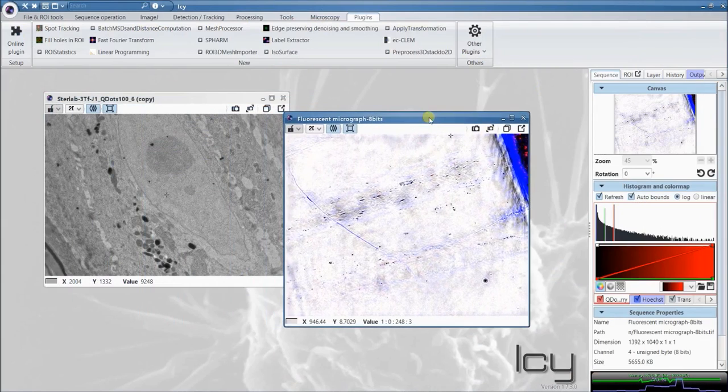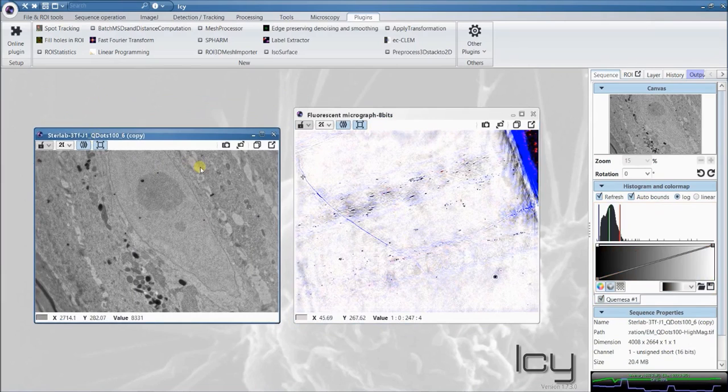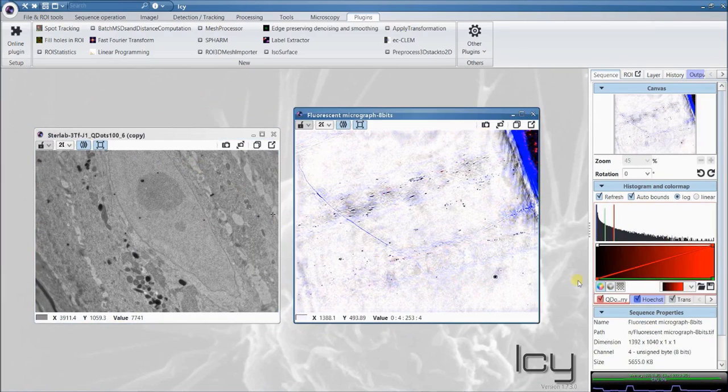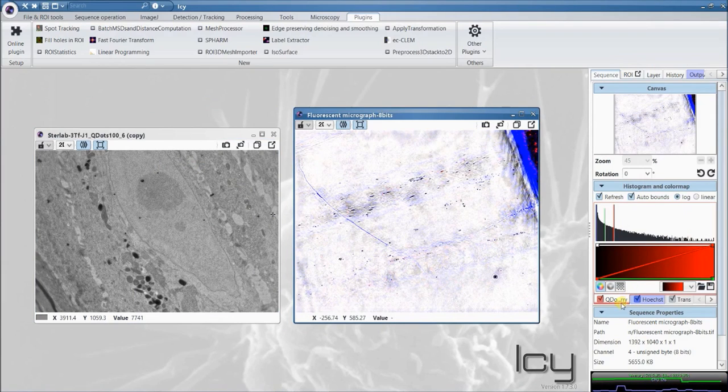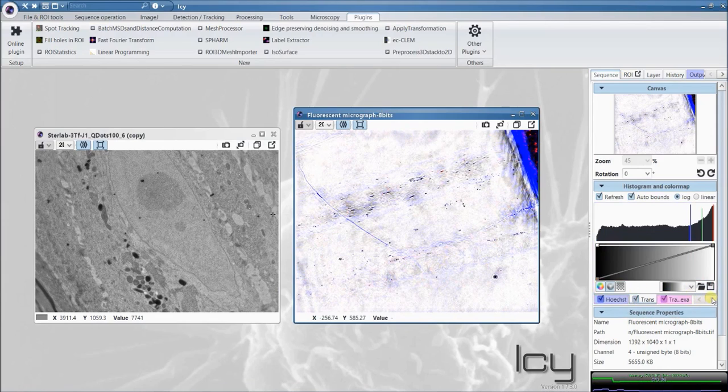Once it's open here, we see we have a fluorescence micrograph here and an electron micrograph that corresponds to it. In the fluorescence micrograph, you can see in this side panel that we have the colored channels of the different channels of the fluorescence.